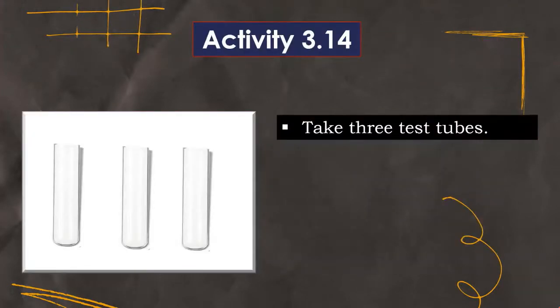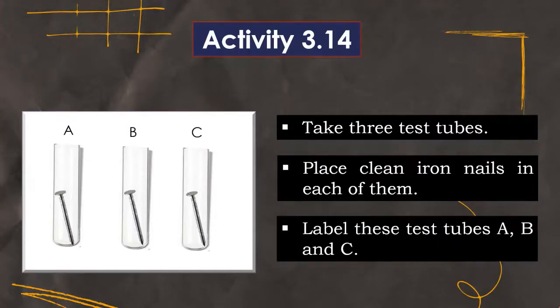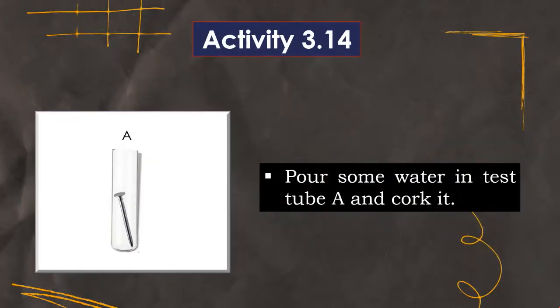Let us perform this activity. The first step is take three test tubes, place iron nails in each of them, and label these test tubes A, B, and C. Next, pour some water in test tube A and cork it.